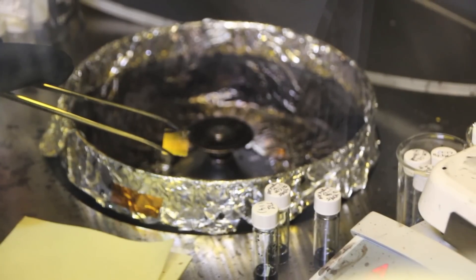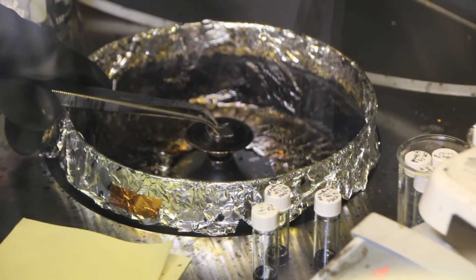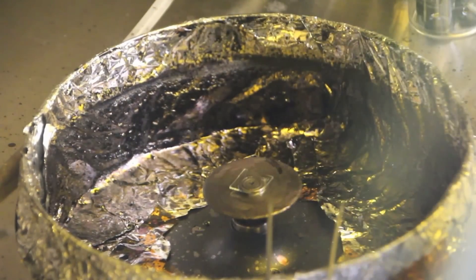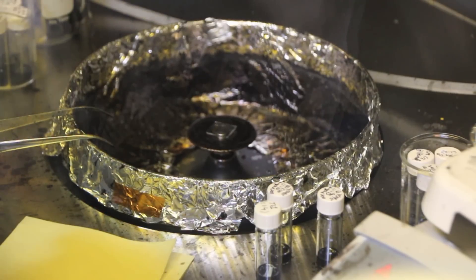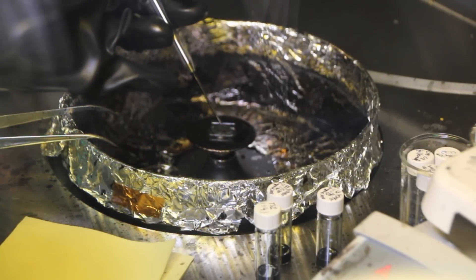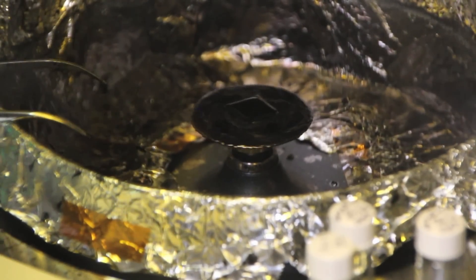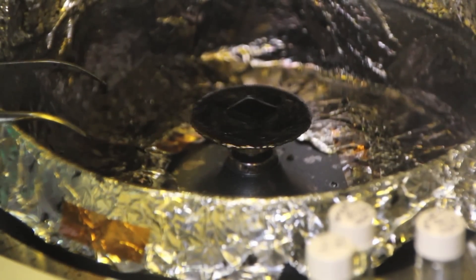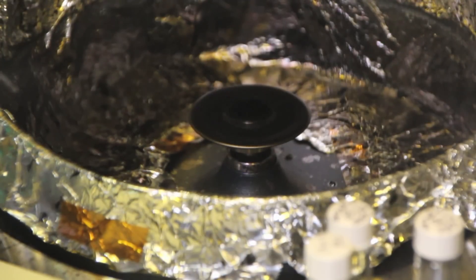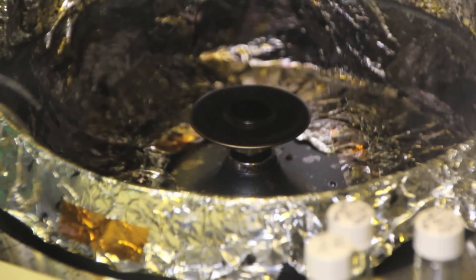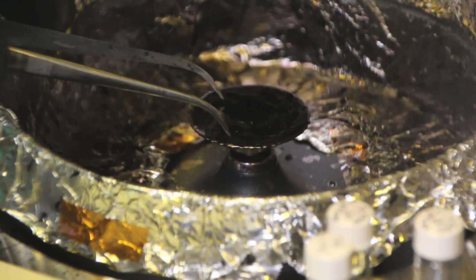Next, it's time for active layer coating. The substrates are placed on the hotplate for about 15 minutes. The heat allows for uniformity of the active layer on the substrate. The solution is dropped onto the substrate and is spun at 1600 RPM for around 20 seconds. After coating, the devices are vacuum dried for an hour and annealed at 100 degrees Celsius for 5 minutes.